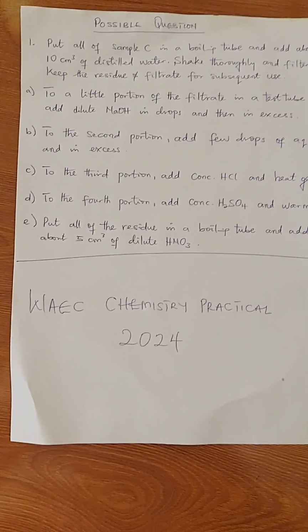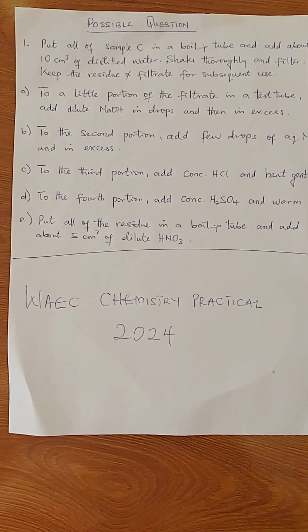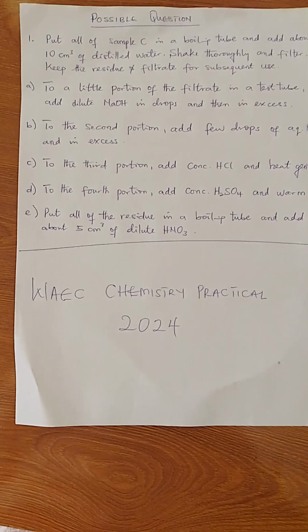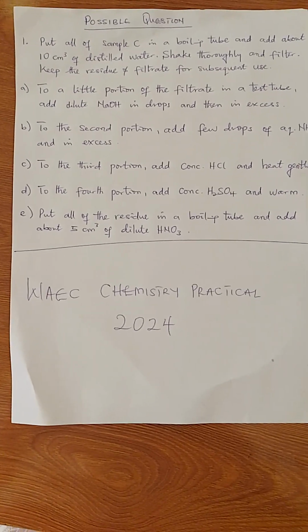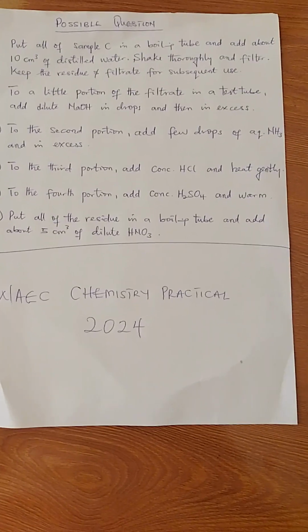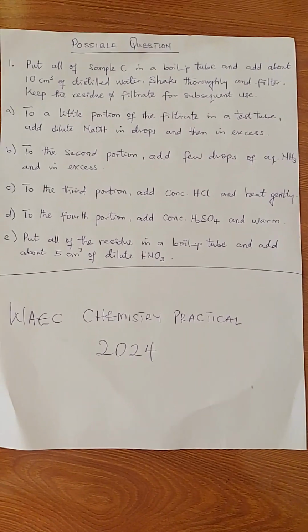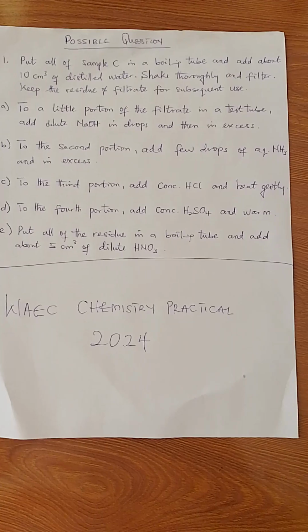And the last possible question is: put all of the residue in a boiling tube and add about 5 cm³ of dilute HNO3. I've done this in the lab, and I want to give you the observations and inferences.